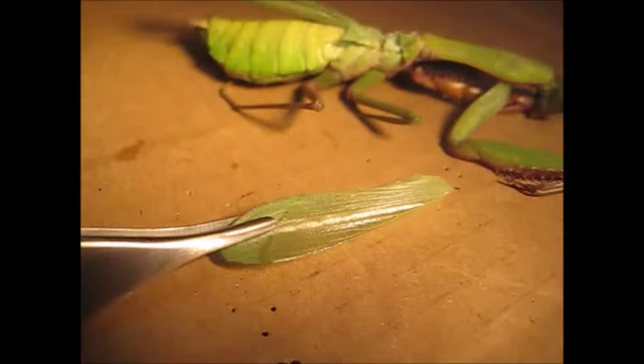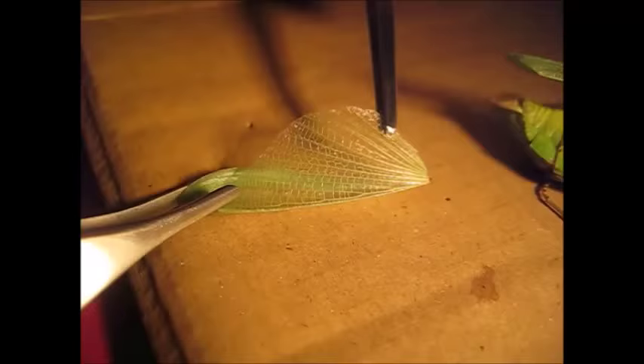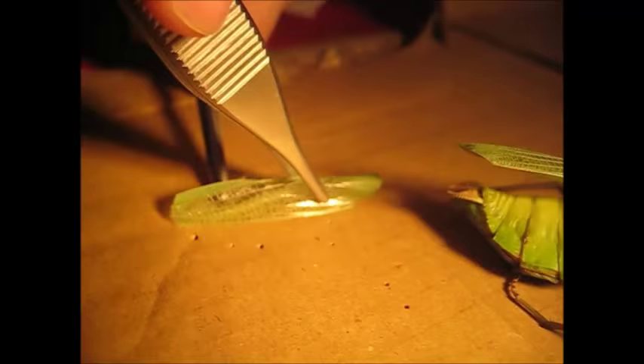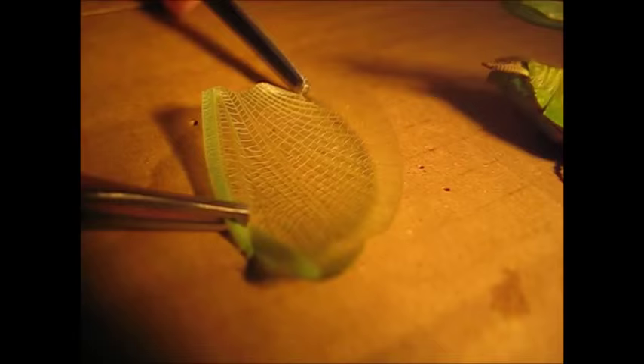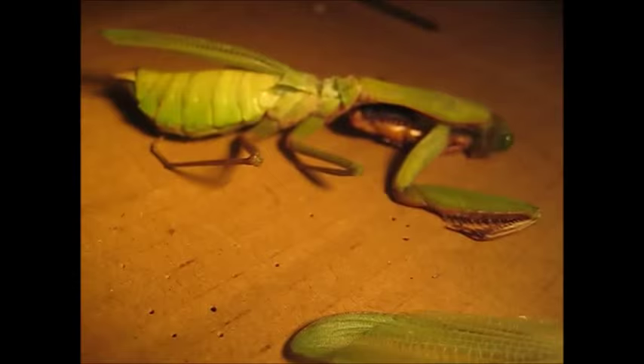This is the wing here. If I stretch this out you can see the absolutely beautiful membrane. If I flip it over and stretch it out like that — there you go, that's the full extent of the membrane. So there are the two wing covers and then the one wing membrane there.